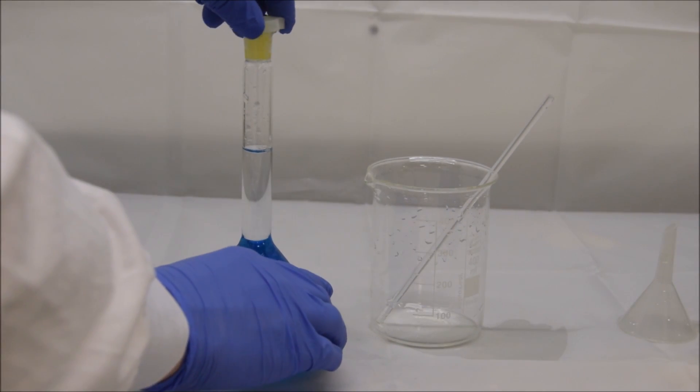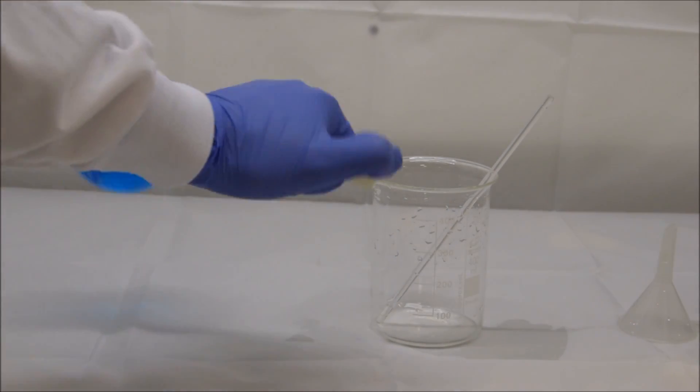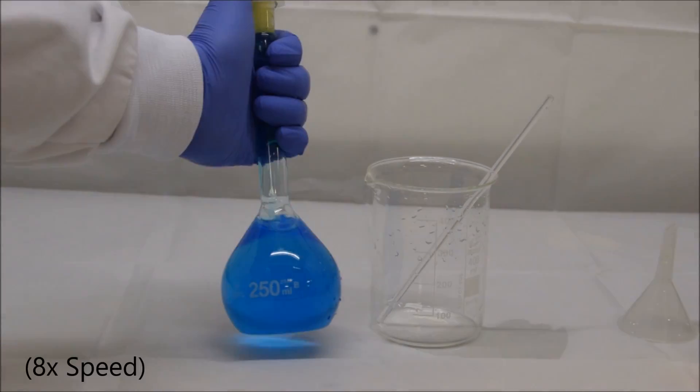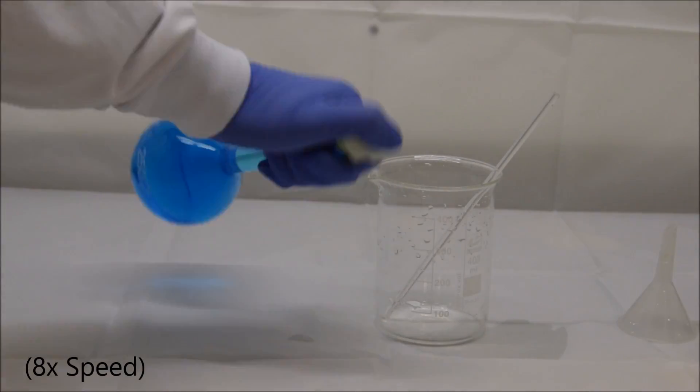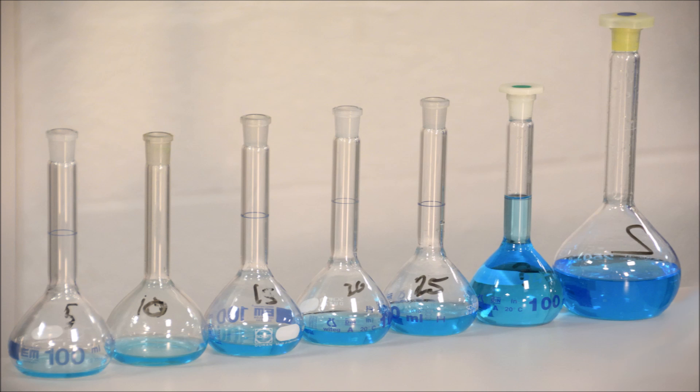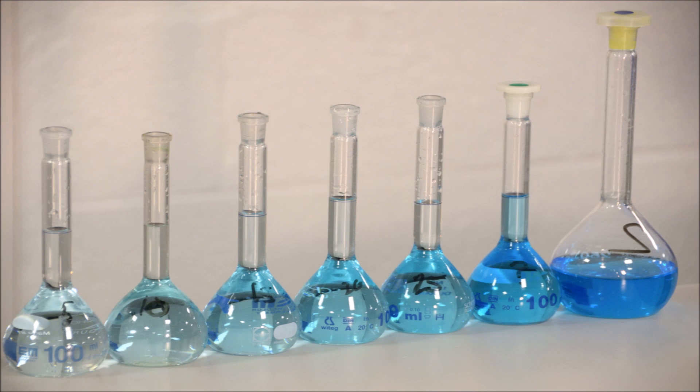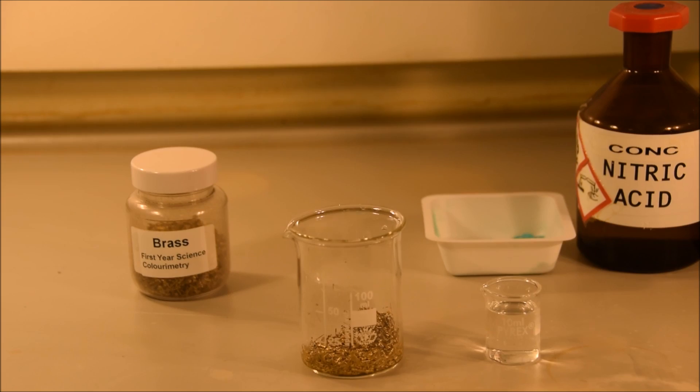Okay so very last step then before we're finished. Make sure that the stopper is in place, twist it and push down and then put your thumb on the top, grab it by the stem and invert it twenty times. Once we're finished making up our standard, we can dilute it down into several different concentrations by pipetting different amounts into 100 mL volumetric flasks and making each of those up to the line. Then we're ready to get the UV-Vis spectrometer out and start making our measurements.